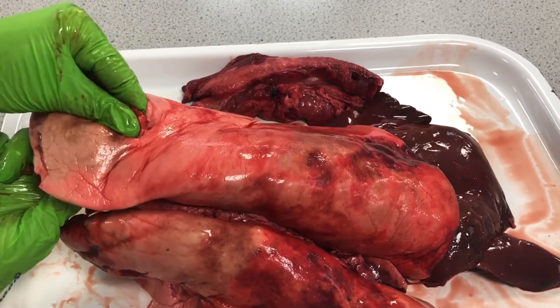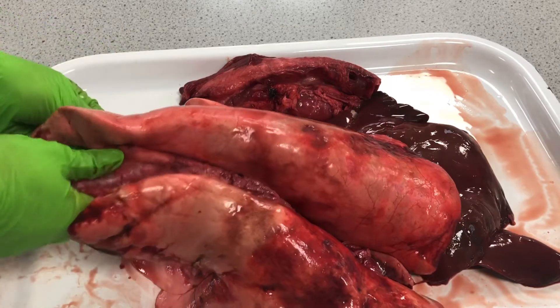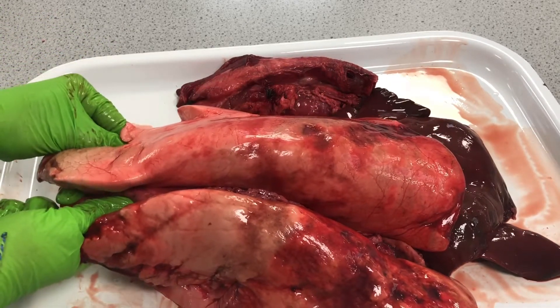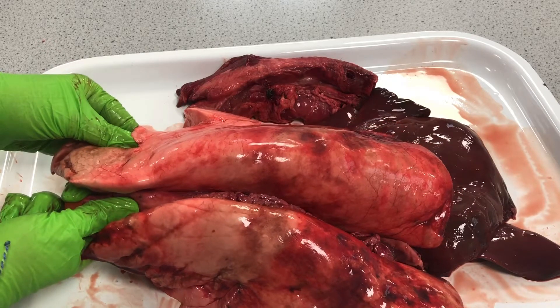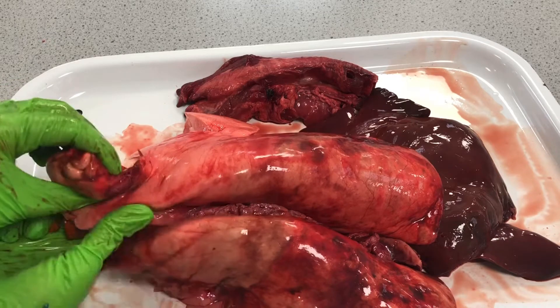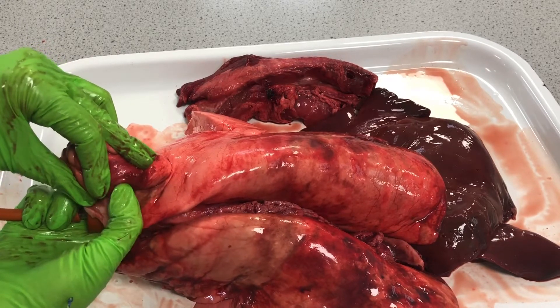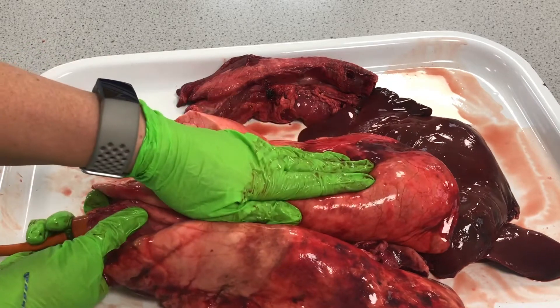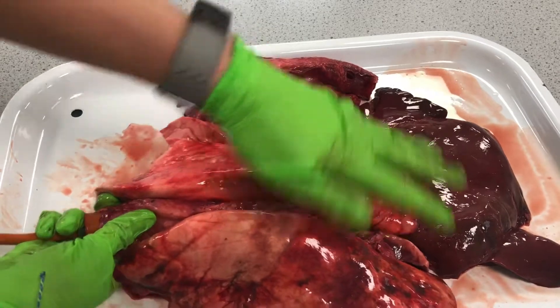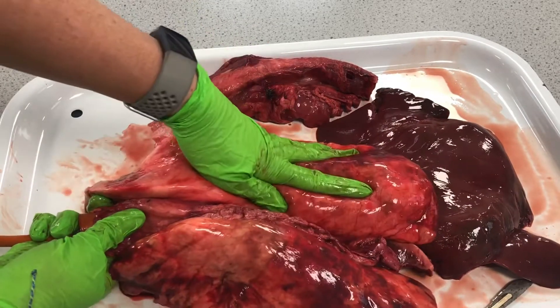Our lungs don't inflate fully on every breath, but this is showing us really quite well what the lungs look like as they're inflated. If we deflate that so we can see it — that is exactly where our leak was. It's amazing the difference — just having a couple of bronchioles cut there has made a massive difference.